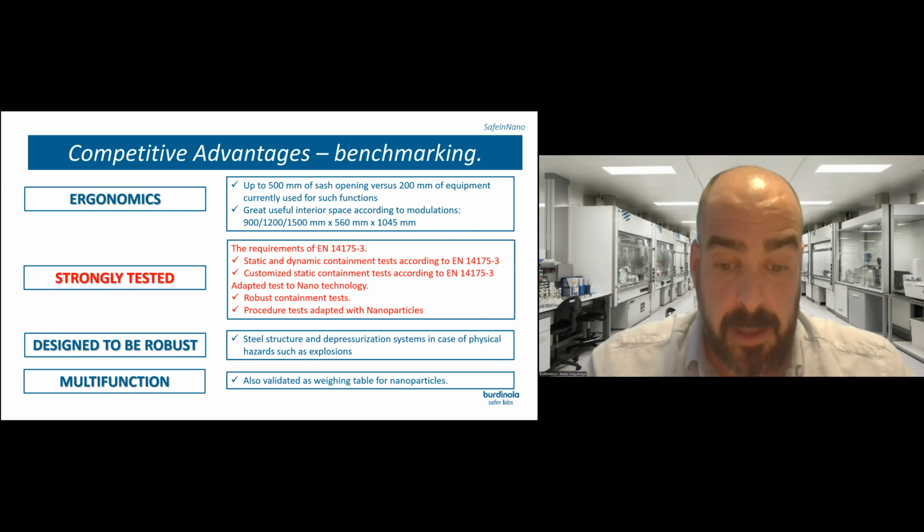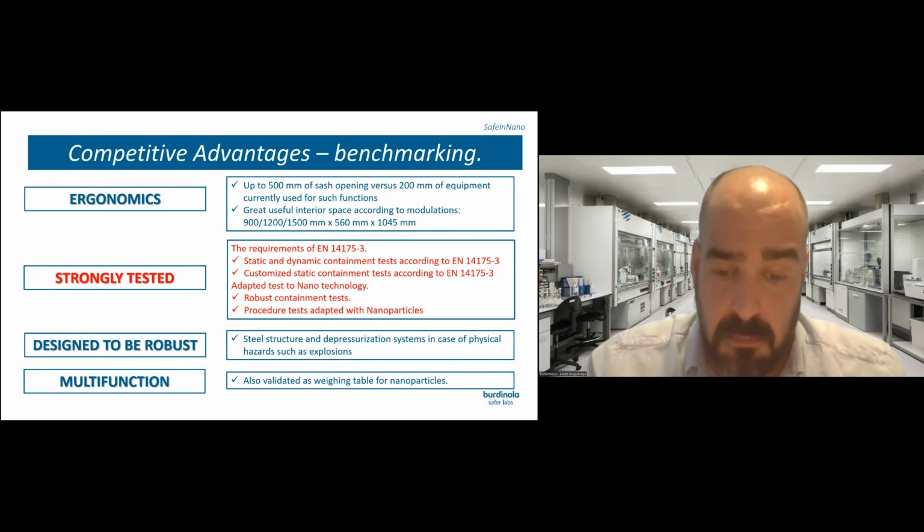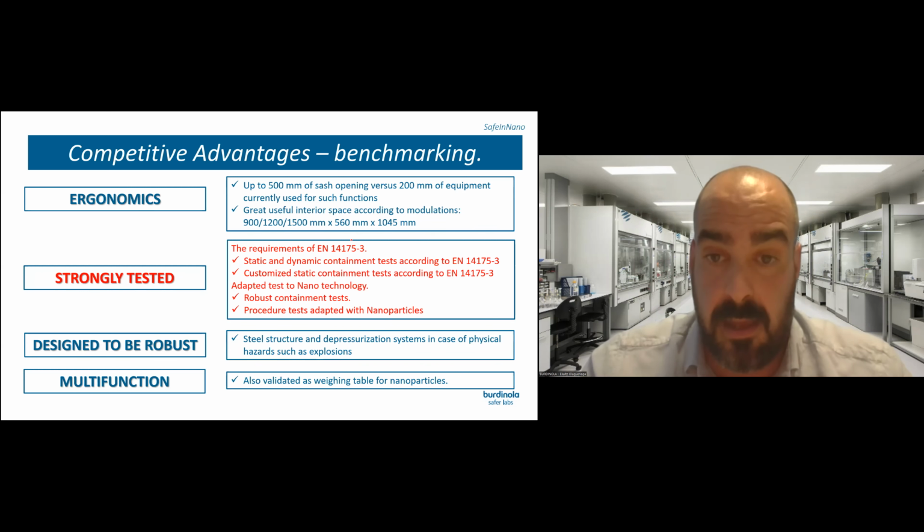I have mentioned before that there is no standard to test this kind of equipment, so we have developed our own test protocol, and it's based mainly on two tests. The first one is based on the standard EN 14175, the one used for fume hoods, and the other one is an adaptation of the test used for fume hoods.